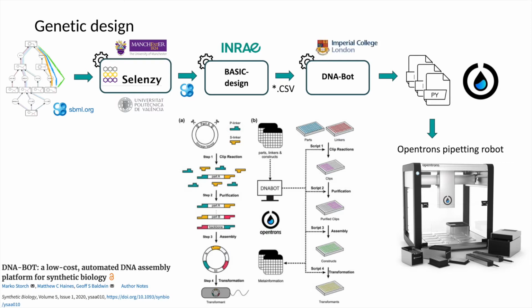Finally, the DNA-BOT node generates the set of Python scripts to build the plasmids using an OpenTrons liquid handling robot. After downloading these scripts onto a computer connected to an OpenTrons, the user can perform the automated construction of the plasmids at the bench.